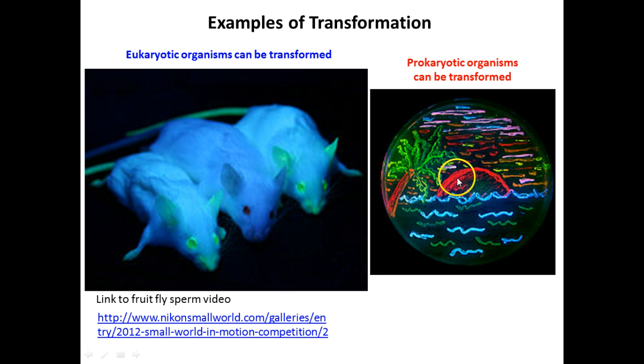This is one with bacteria, and lots of different fluorescent proteins. They had a little bit of fun and drew a nice little tropical scene with different bacteria expressing different fluorescent genes. So again, what would be the purpose of doing this? That's kind of fun and pretty and artsy.